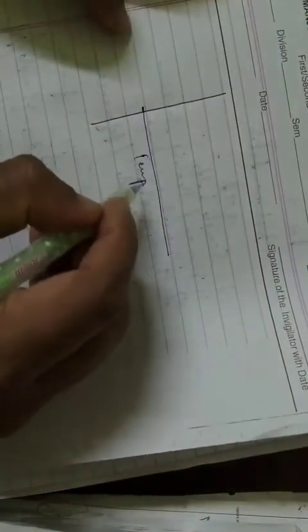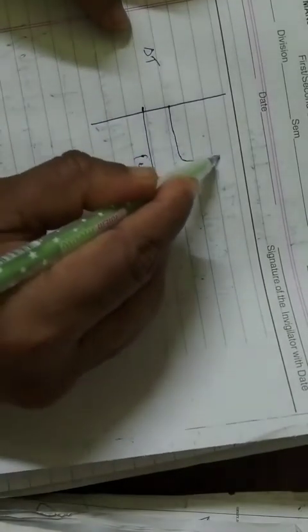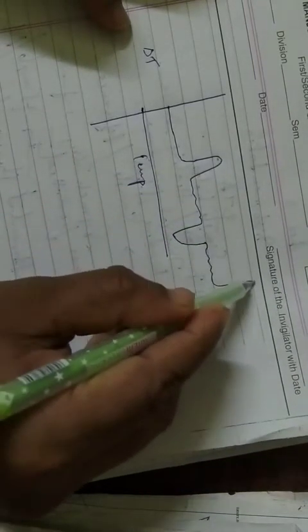So exothermic, endothermic, oxidation, reduction: as per the nature of the sample, we can see the peaks arising here. Now, one of the applications of this is polymeric materials, so DTA is also very important here. If you see the temperature and the delta T signal for a polymer, you can get something like this.